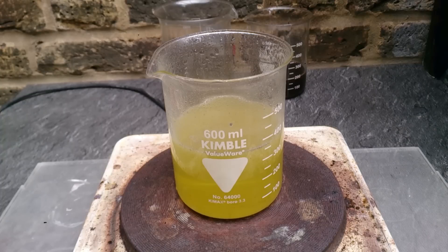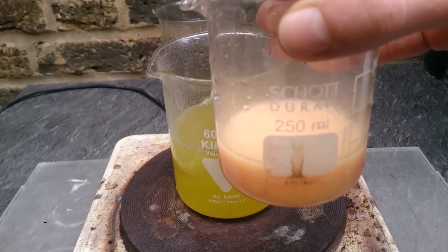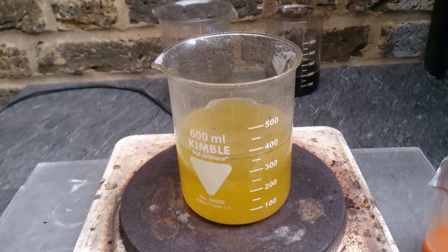I'm turning on the hot plate just to warm it up a little bit, and finally adding just a little bit of vitamin C that I bought from a supermarket. Keeping it on the hot plate just to warm it up.